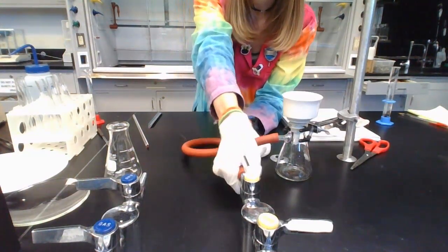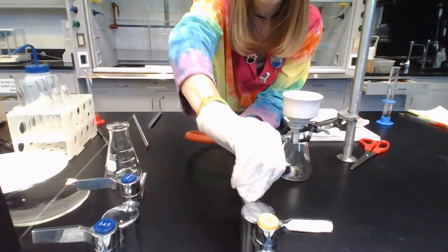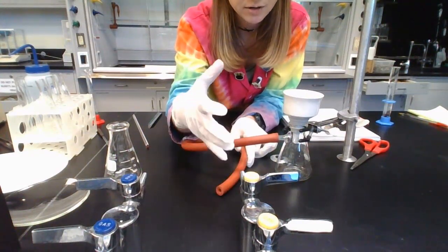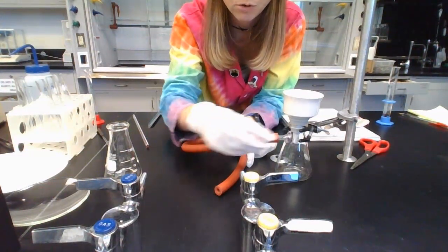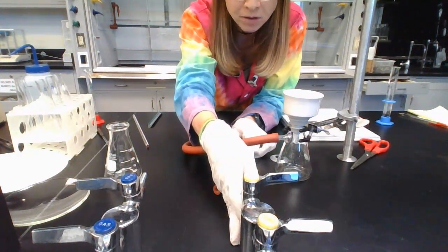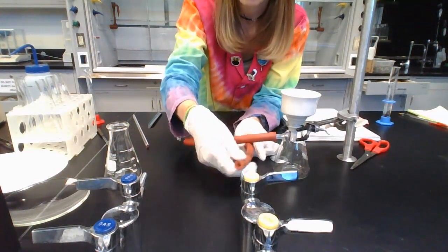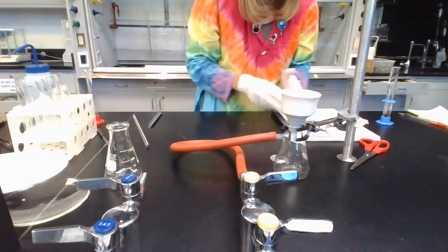We have a two-step process. First, we're going to remove the hose from the valve, and then we're going to shut off the valve. That seems silly. What can happen is if you don't take the hose off, we can have some backlash things. What happens is the liquid could get pulled into the tubing that would go into the vacuum. There's a vacuum pump on the end of this that would just destroy it. Okay, so when you turn it off, you have to take the tubing off and then the valve. When you start it, the tubing is on and then you turn the handle.